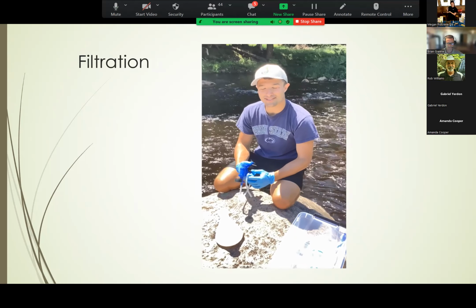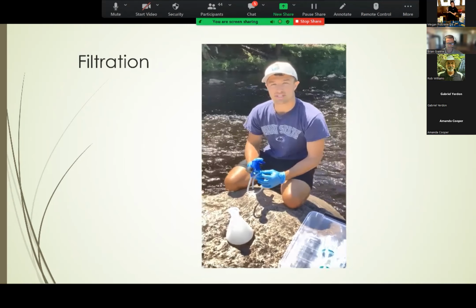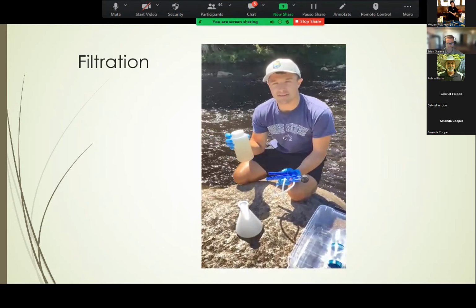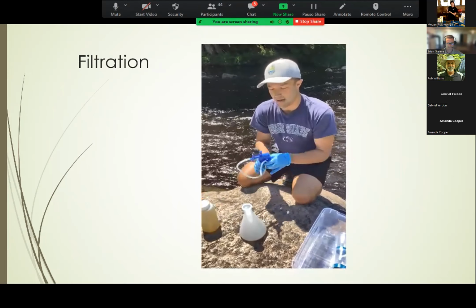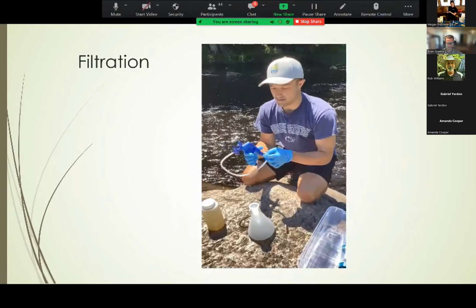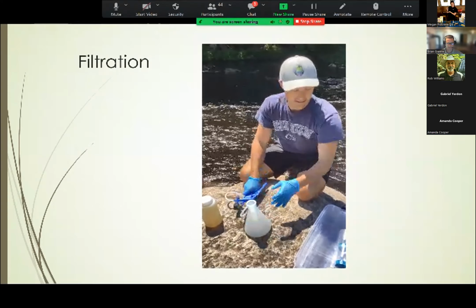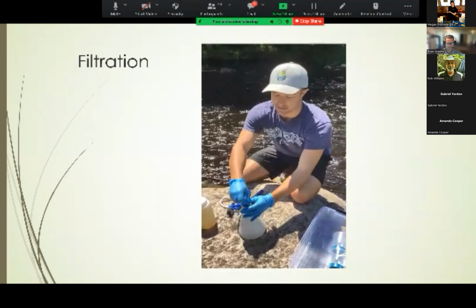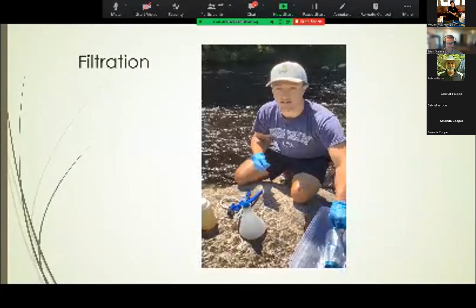Hello, welcome to part 2 of our eDNA sampling protocol. This section of the video will be the filtration process. So here we have the water sample that you saw collected in the last part of the video, 1,000 milliliters in a sterile 1 liter container. We have a 1,000 ml flask and a hand vacuum pump. First I'm going to connect the hand vacuum pump to the flask. We have a small funnel and a plug. Attach those. These have all been decontaminated prior to use and will be re-decontaminated after this round of sampling.